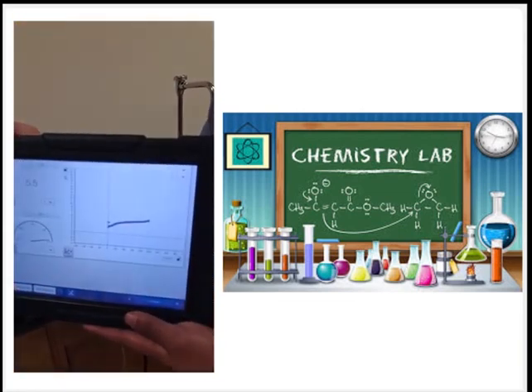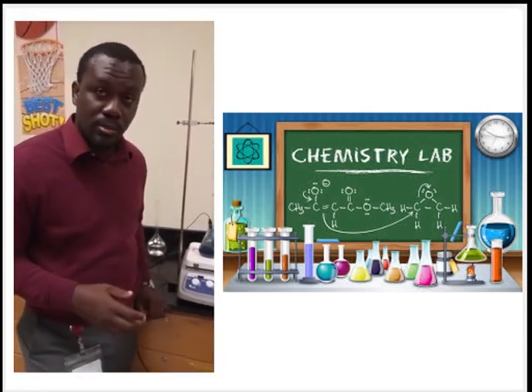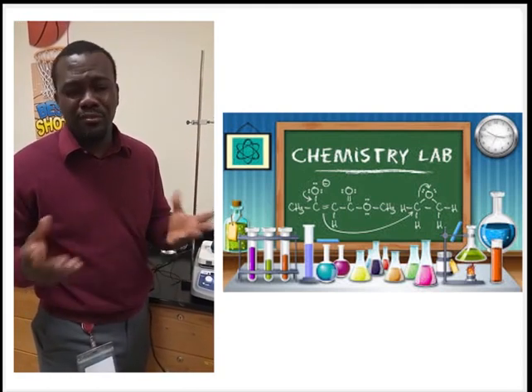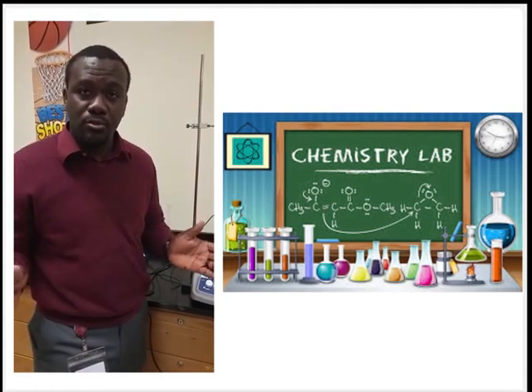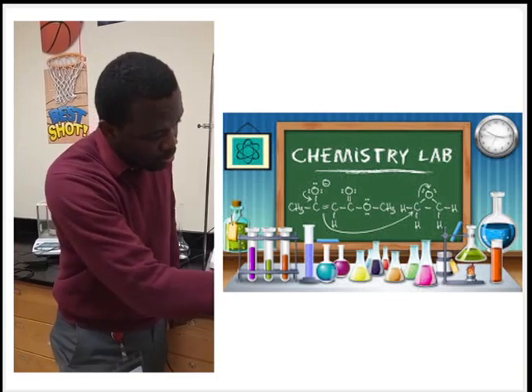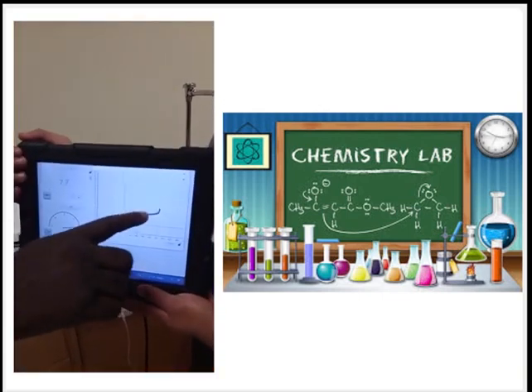We're really going to talk about this because of what's happening with the weak acid. There is a certain fight, not really a fight, but some of the ions are reverting back to make the initial acetic acid. So this is what you can observe in the beginning of the curve.